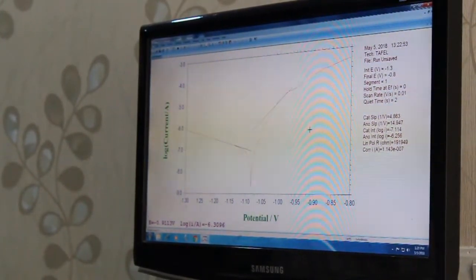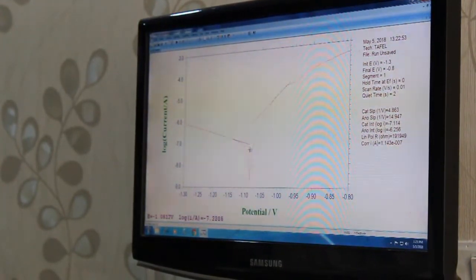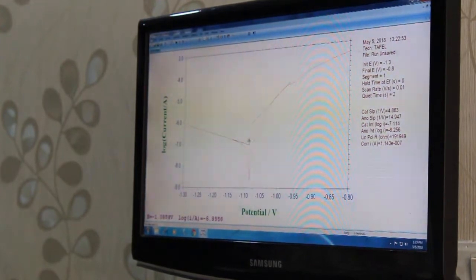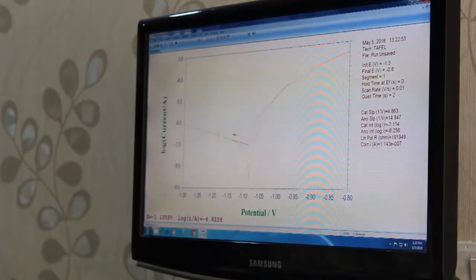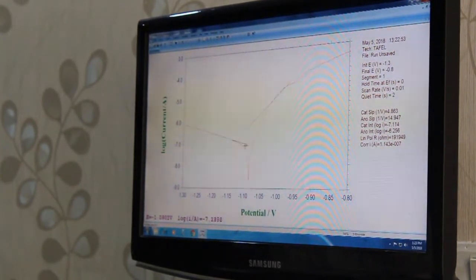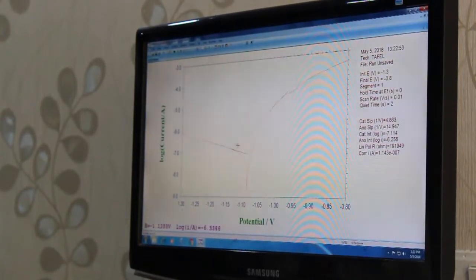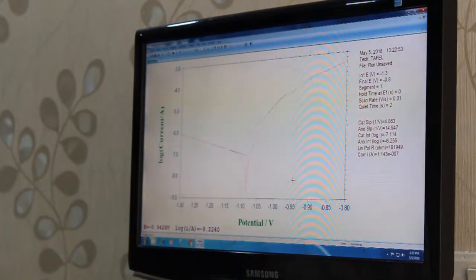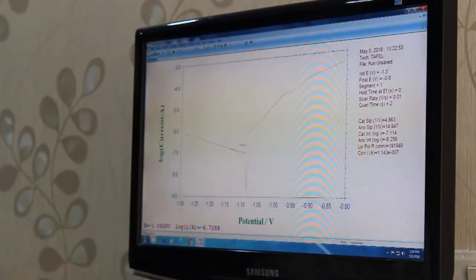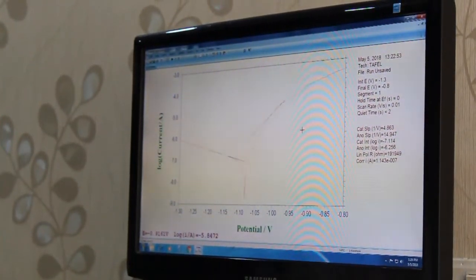Are you happy with that? No. Basically, it looks at this potential. Some of these are not intercepting. That is because of the chemistry behind the layers, over which as a user we do not have any control. The user can only do an equilibrium and do the measurements. So the results coming out as an exactly theoretical curve like this is not in our control.